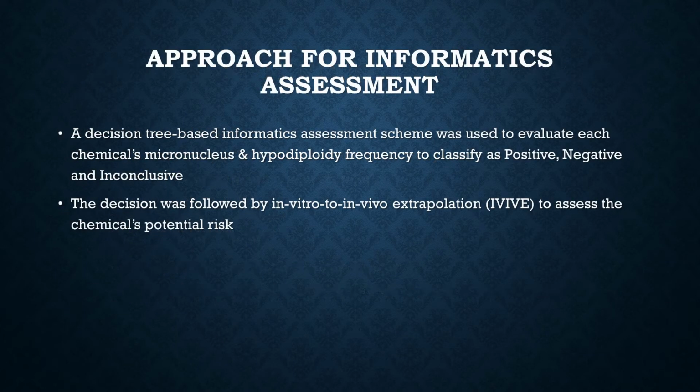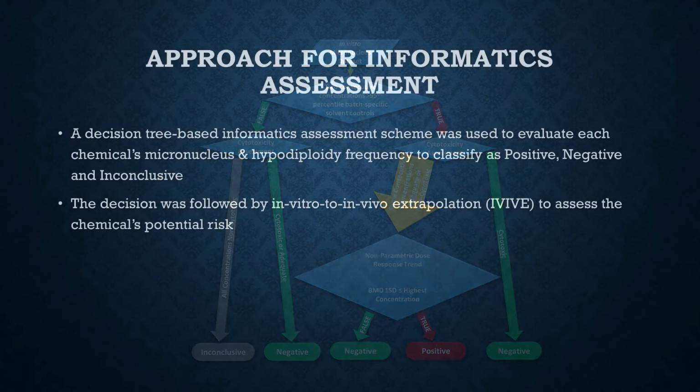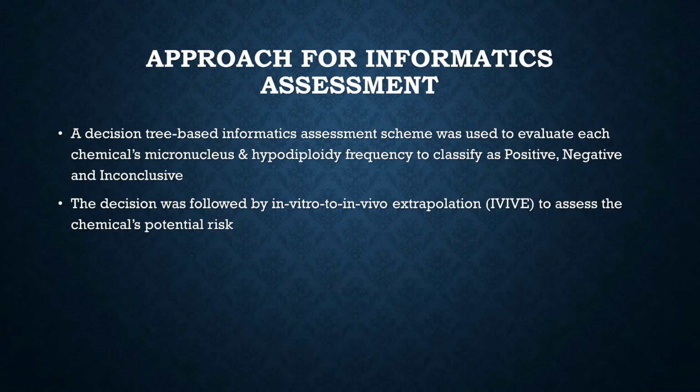In this project, we propose a decision tree-based informatics approach to evaluate each chemical's micronucleus and hypodiploidy frequencies and classify them as positive, negative, and inconclusive. An in vitro to in vivo extrapolation analysis follows to assess the chemical's potential risk.